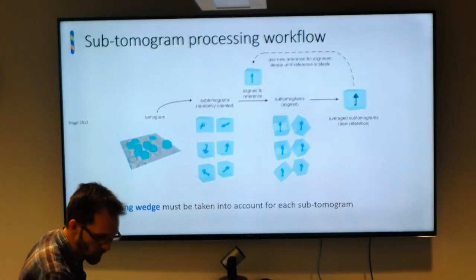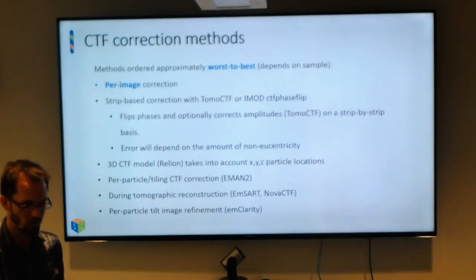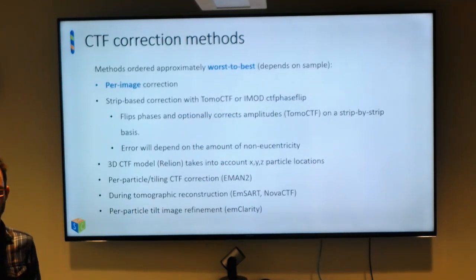Okay, so that was defocus estimation and CTF correction. Are there questions there? The entire field, as you might have noticed already, is in constant development, and it's very ad hoc, and this is how it is now. If you have better ideas, you can write up your own software and add to the pile.